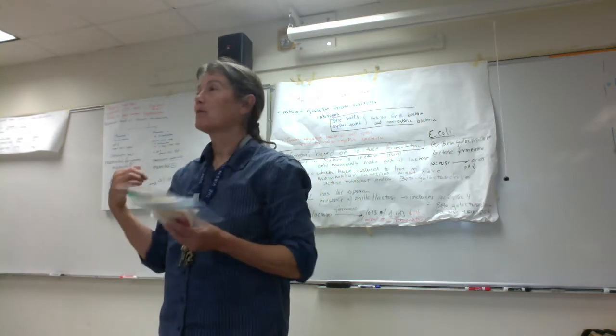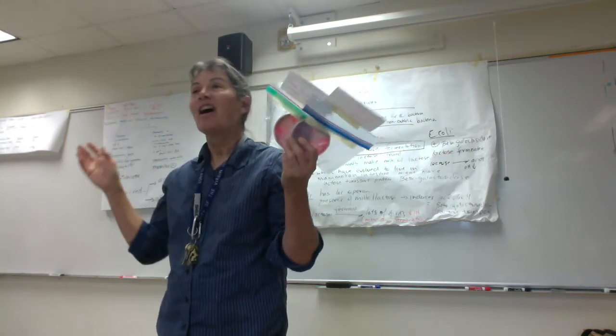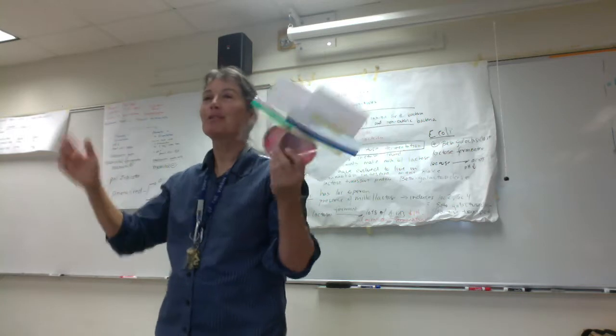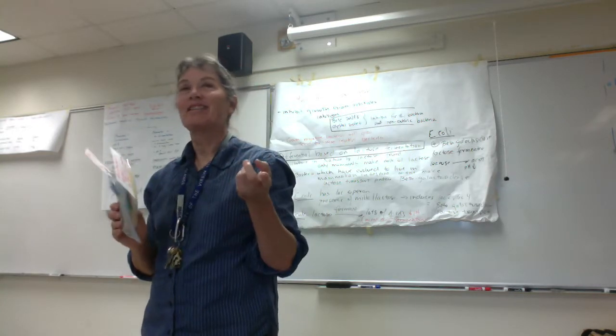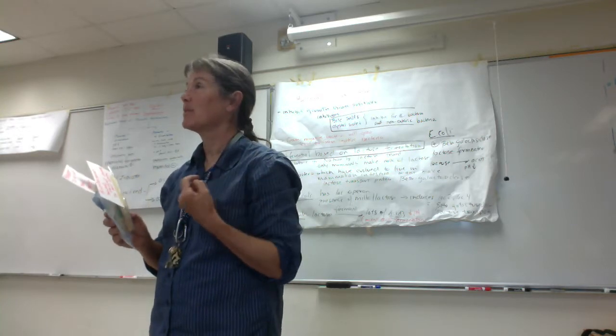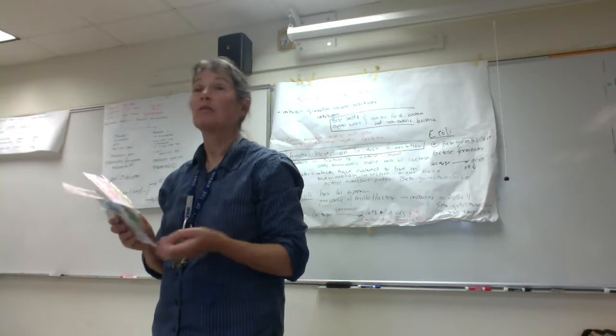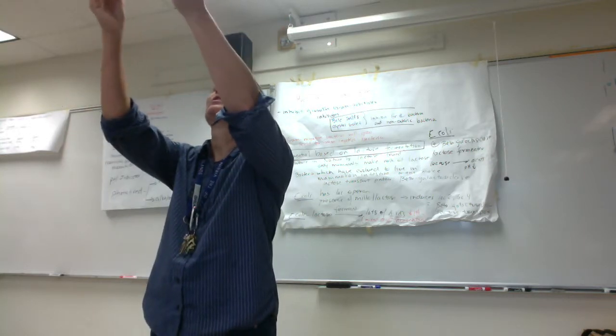So I did a throat swab on myself, and I had these little beta hemolytic colonies. And I was all excited. I was like, oh, I think I have strep throat. This is perfect for the class. But I went to the doctor yesterday. They did a rapid strep test, and they said it didn't come back as Streptococcus pyogenes, but they're sending it for culture, right?